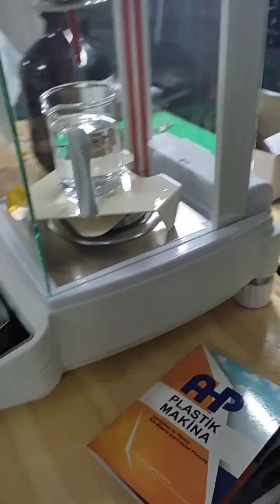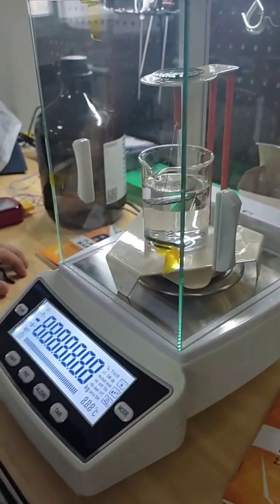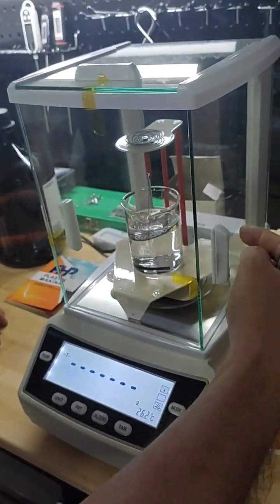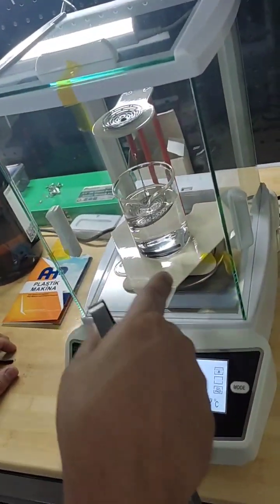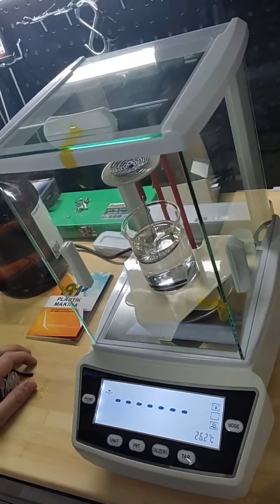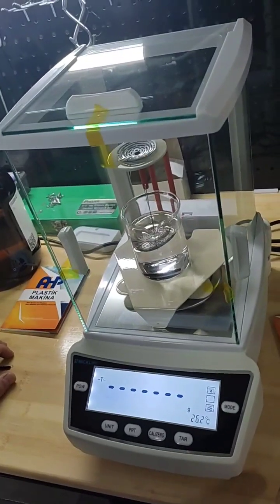We have a precise balance here. The resolution is 0.1 milligram and we have a density kit here. The liquid is methanol. The density of methanol is 0.79 to 0.793.